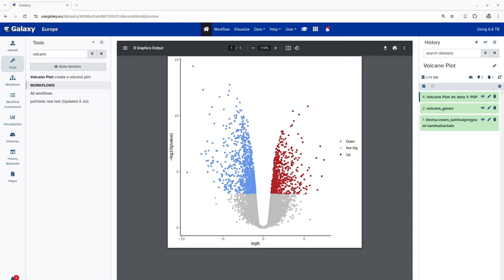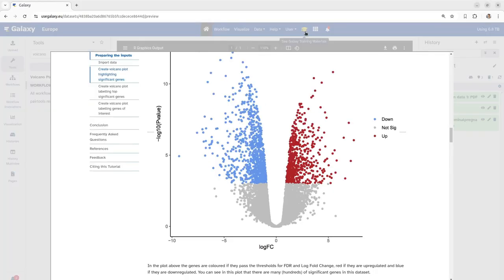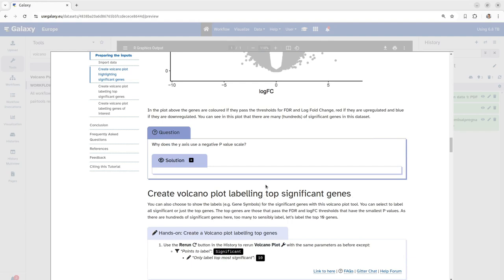This completes our first section. Now, let's go on to the next section of this tutorial which is labeling of top 10 significant genes on the volcano plot. You can choose to show the labels of top 10 highly significant genes here based on those who have passed the FDR and log fold change and smallest p-values. So, to do this, you have to just click the rerun button and select significant in the points to label option and specify the number of labels or genes you want to highlight on your volcano plot.